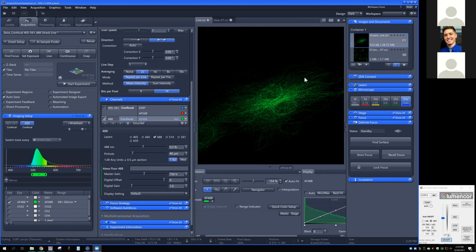So the Airy Scan at the end of the day is actually a filter-based detection range that we're going to be working with. Whereas with the confocal detector, the spectral detector, we have very fine control over exactly what wavelengths are reaching those detectors. And so I think it'll be a good exercise to try to work with and play with both of those.